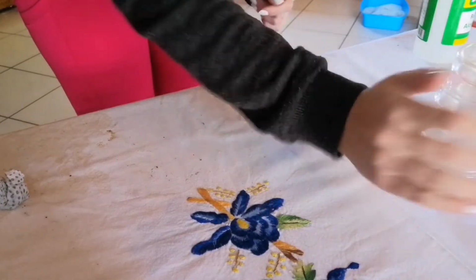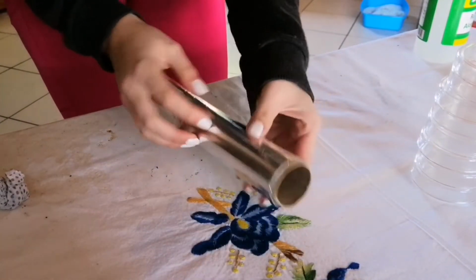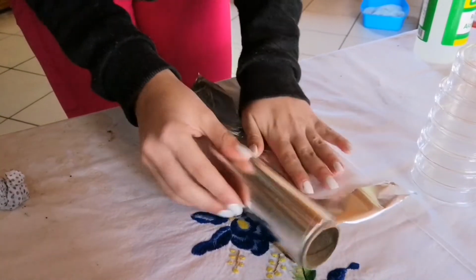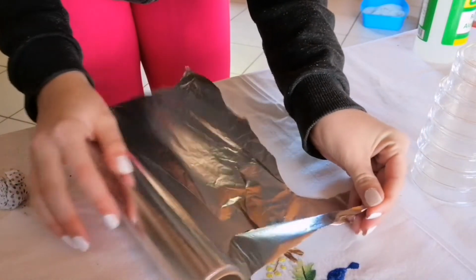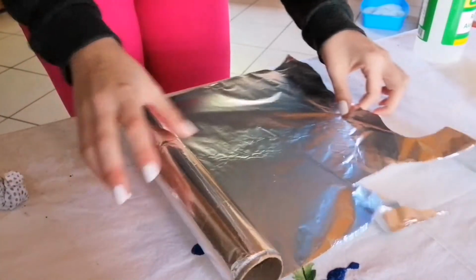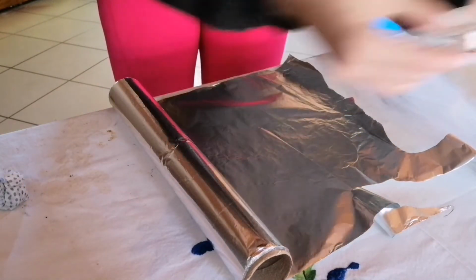Okay, now that I've cleaned all my petri dishes, I'm going to wrap them up in some aluminium foil. So I am opening it. As you can see, it's a bit of a struggle because it keeps tearing, but we get it right eventually. Okay, so I'm just opening it up, and then I'm going to place the petri dishes in the foil. This just helps to keep them together while they are in the oven, and the foil also helps to keep the germs away.